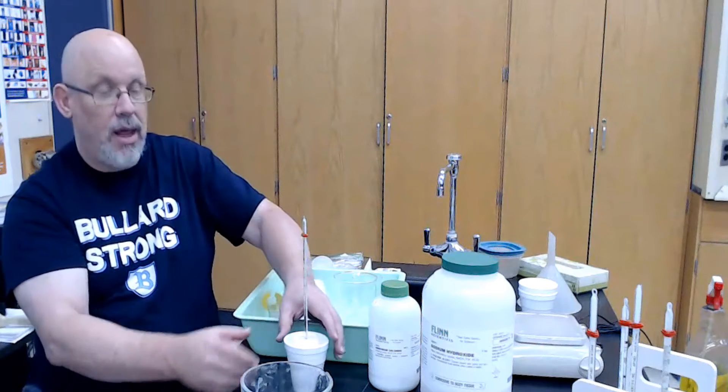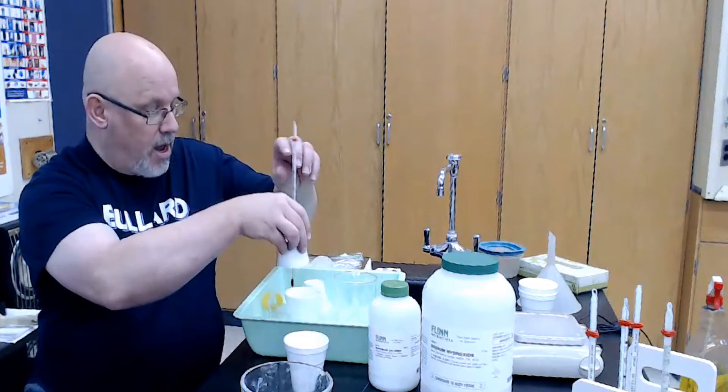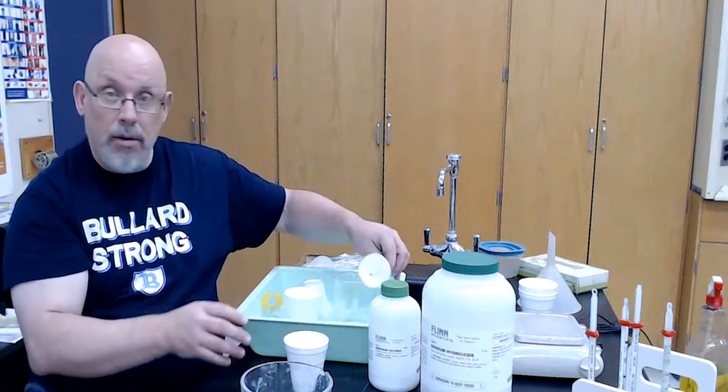So if like we have 20 grams of water and we put in two grams of sodium hydroxide, then the total mass of the solution would be 20 plus 2, 22. Anyway, we'll do that result and you will get a number that's either a positive or negative temperature change.